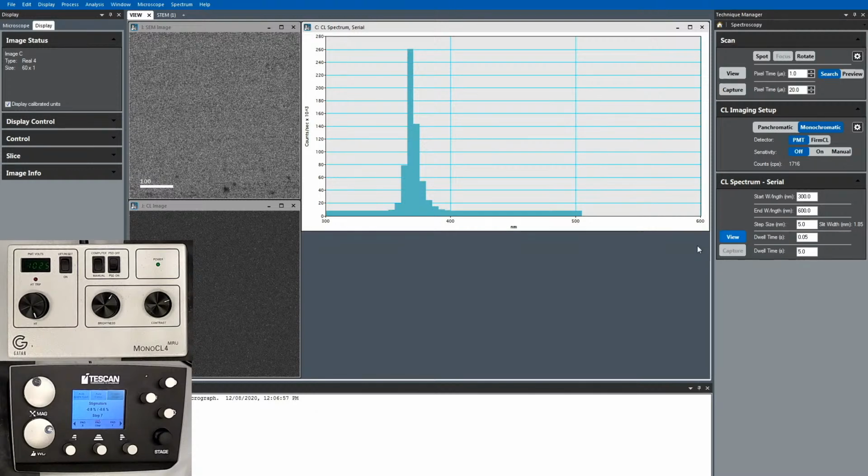So we set the beam up and we focus and stigmate and align the beam in standard SEM imaging conditions. I set the sample to about 15 millimeter. That way I knew it would be safe to insert the mirror. At that point, I just walked over to the CL system and opened the shutter. That way we can get light to the photomultiplier, and I crank in the mirror. Once the mirror is in, then I can turn on the photomultiplier, increase the voltage, and start to raise the sample up to around 6.5 millimeter working distance.